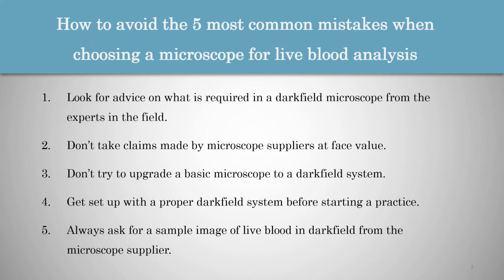Are there any perhaps any questions, Elizabeth? We have some images to look at as well, just a few examples of what we can see in live blood samples in darkfield and what you should be able to see, and then also what you can get from a microscope that's not really suitable for darkfield microscopy. Yeah, thank you for that.